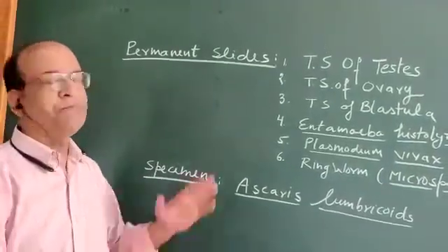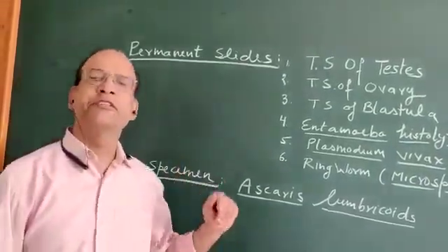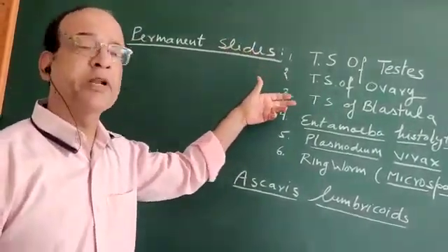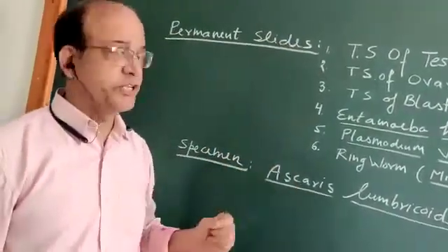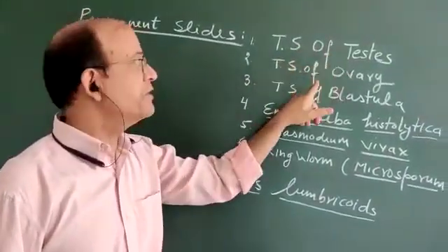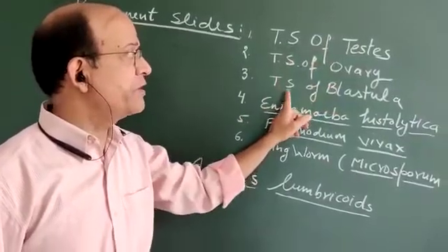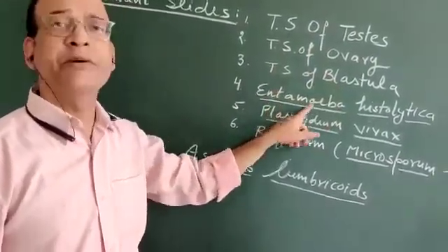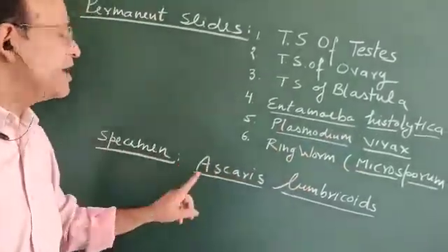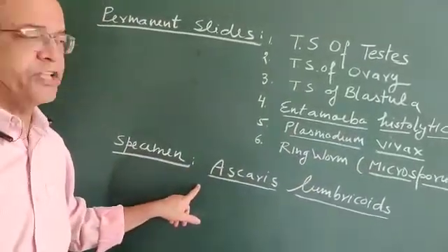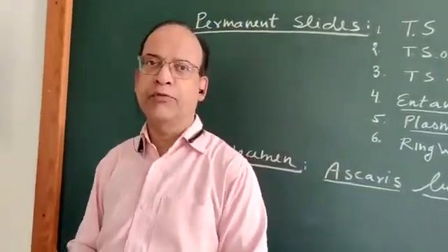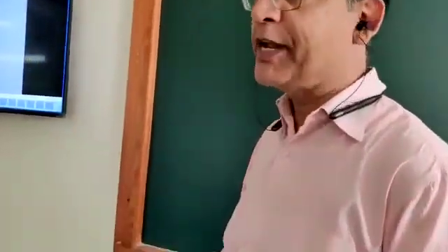Today I am here to show you some permanent slides of reproduction and pathogens. These slides are transverse section of testis, transverse section of ovary, transverse section of blastula, Entamoeba histolytica, Plasmodium vivax, ringworm, and the specimen of Ascaris. So first I am showing you the permanent slide of transverse section of testis.